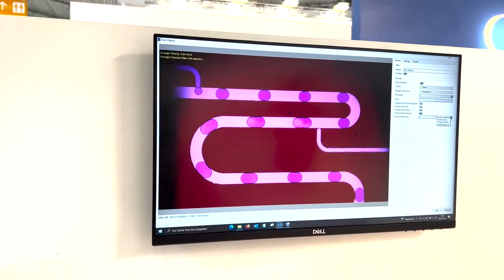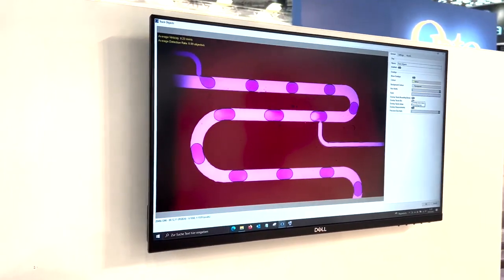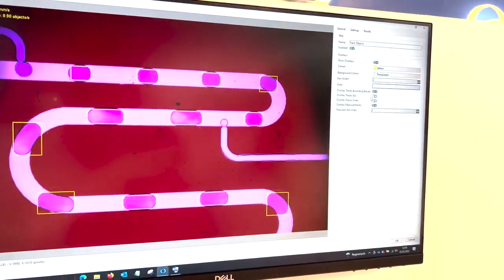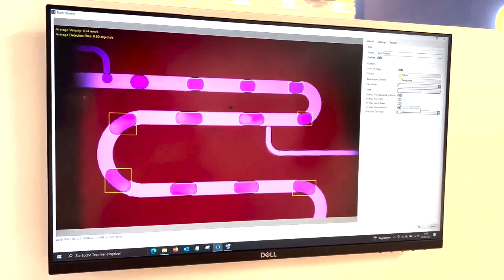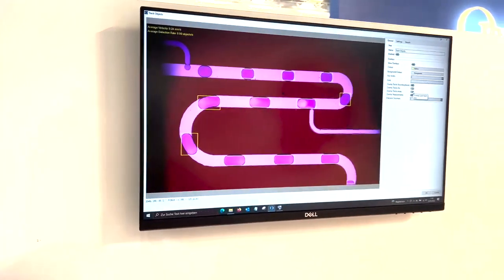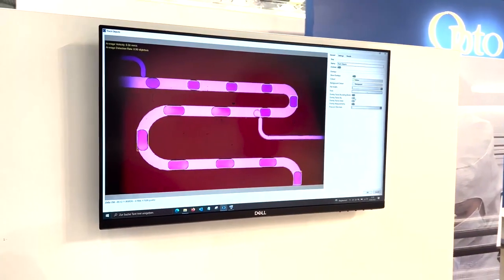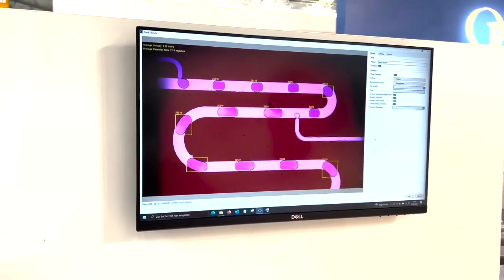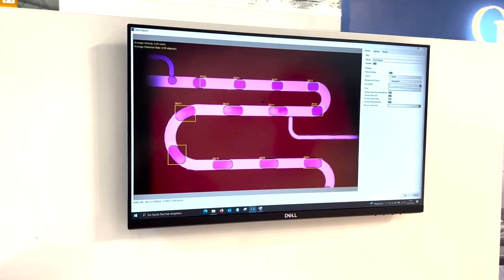This software plugin can be used for the live classification of the droplets. By activating the individual functions, they can be displayed in the live image. For example, the bounding boxes can be displayed. Also, each droplet is automatically assigned a sequential ID. This is important for the process monitoring and the later evaluation of the experiment.